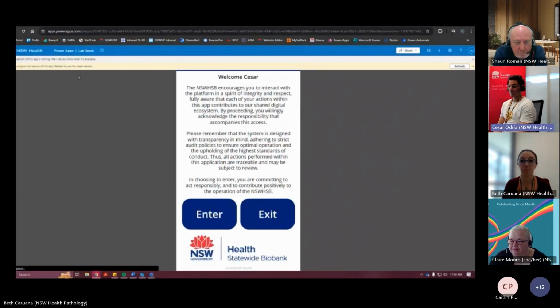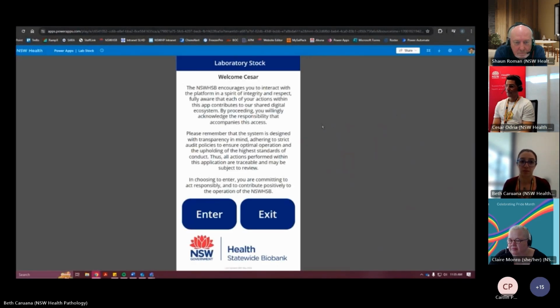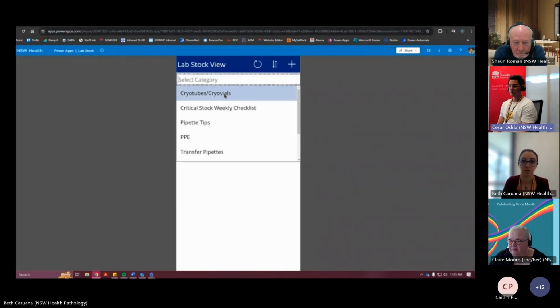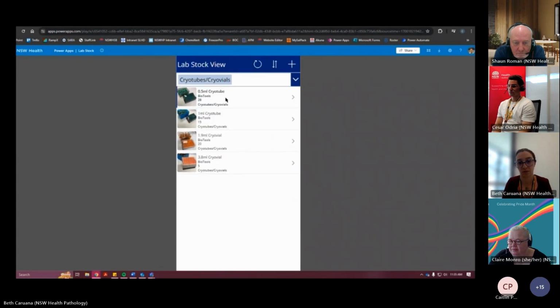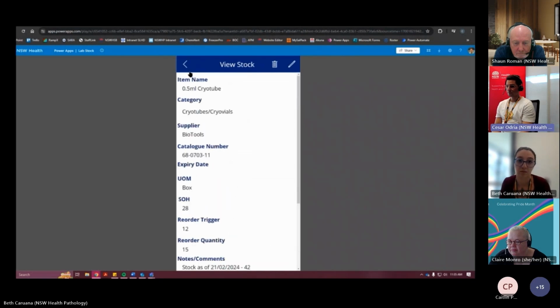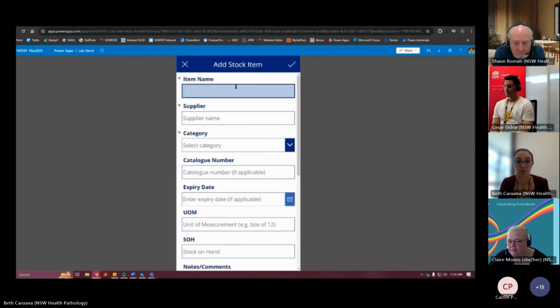Just launching the app. So we'll select our category, and you can see our cryotubes here. We'll go into 0.5 mil, and you can just edit there or view it. And we'll add a new item. Call it test.